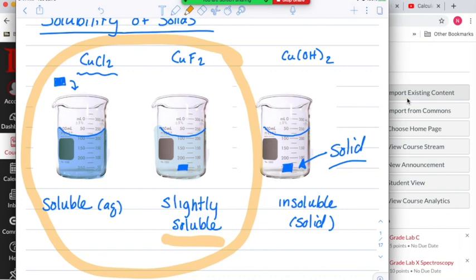And again, by comparing the colors, you really can compare the concentrations, and that's actually a principle that we learned about using the UV Vis. And to Tasso's point, I know it's so much harder to visualize it coming from the video than when you actually do it in class. If you had actually made those solutions, you would have seen a darkly colored solution moving all the way to a very light colored solution. But again, when you have the light colored solution, it does indicate it's not very concentrated because not as much is dissolved into it.